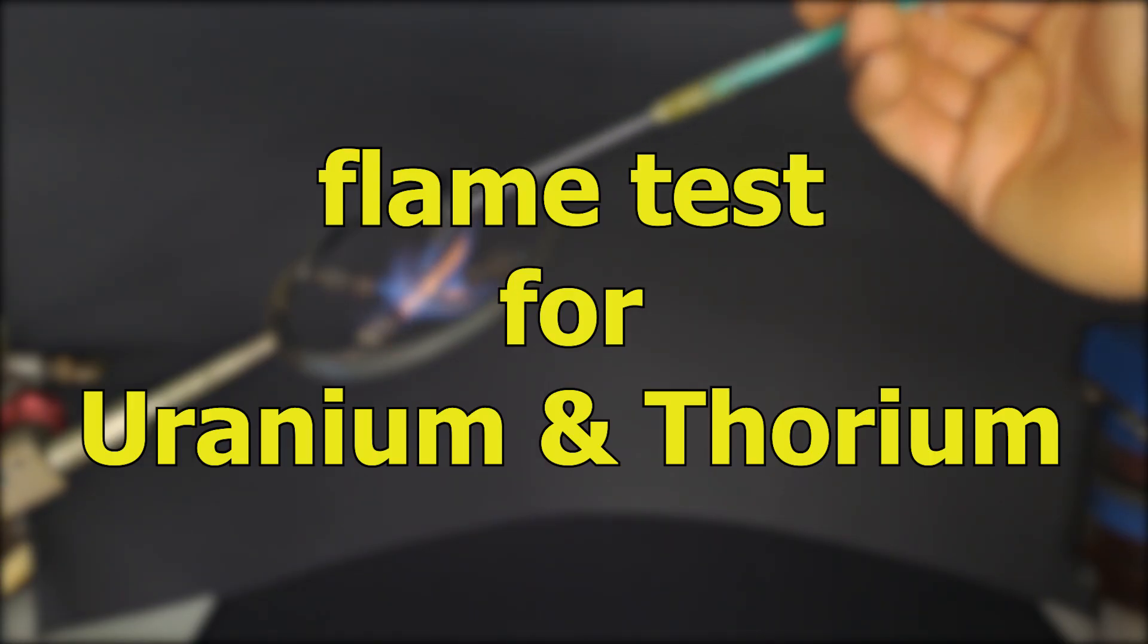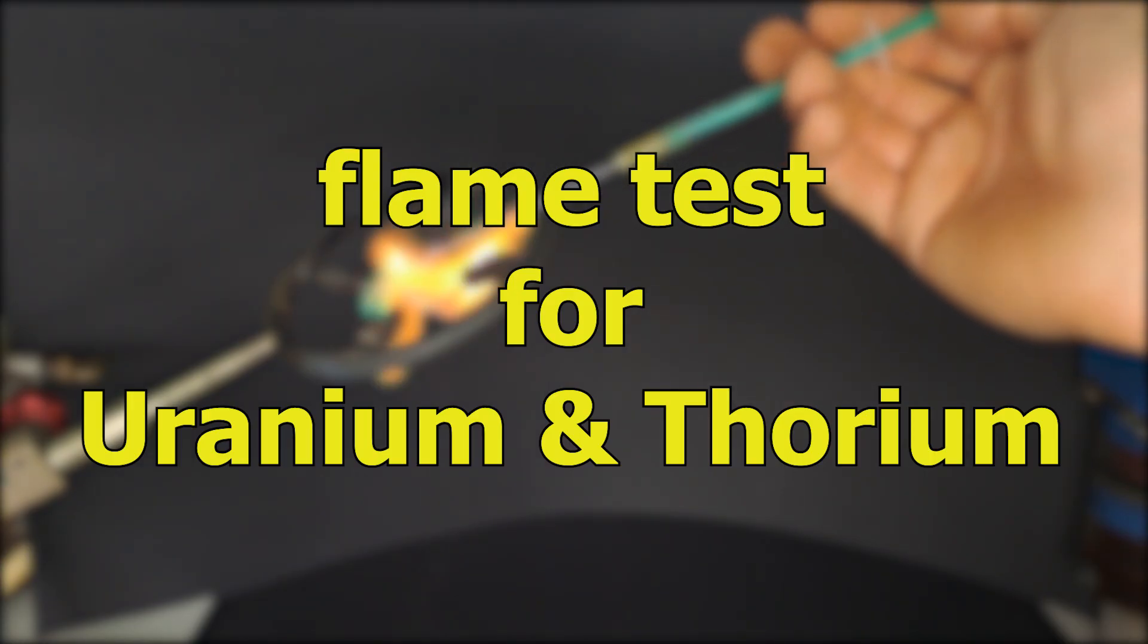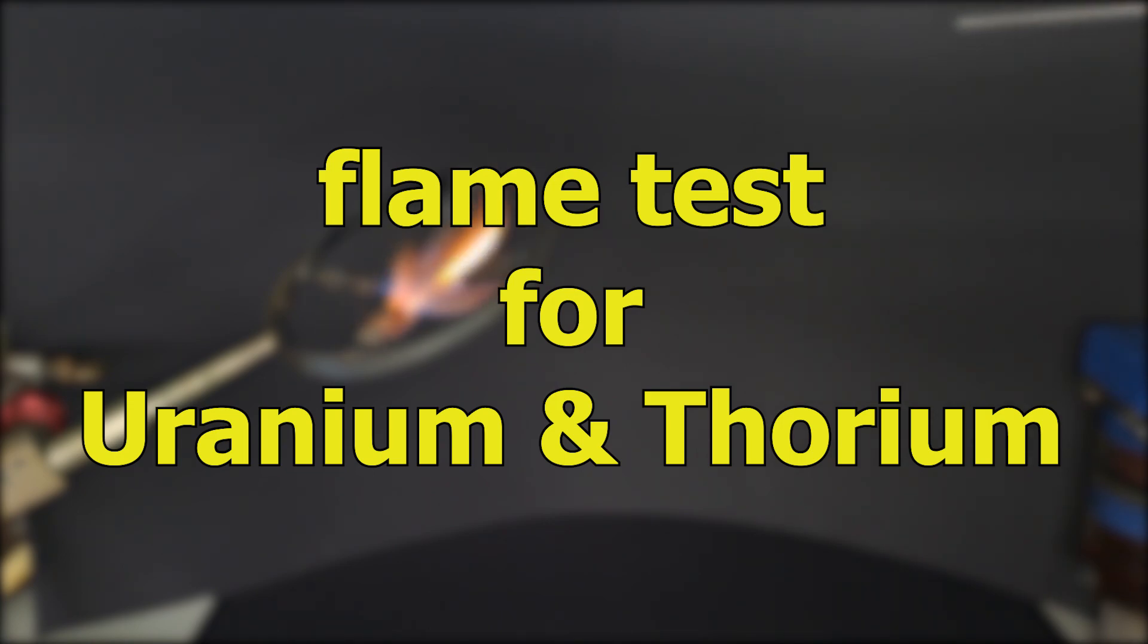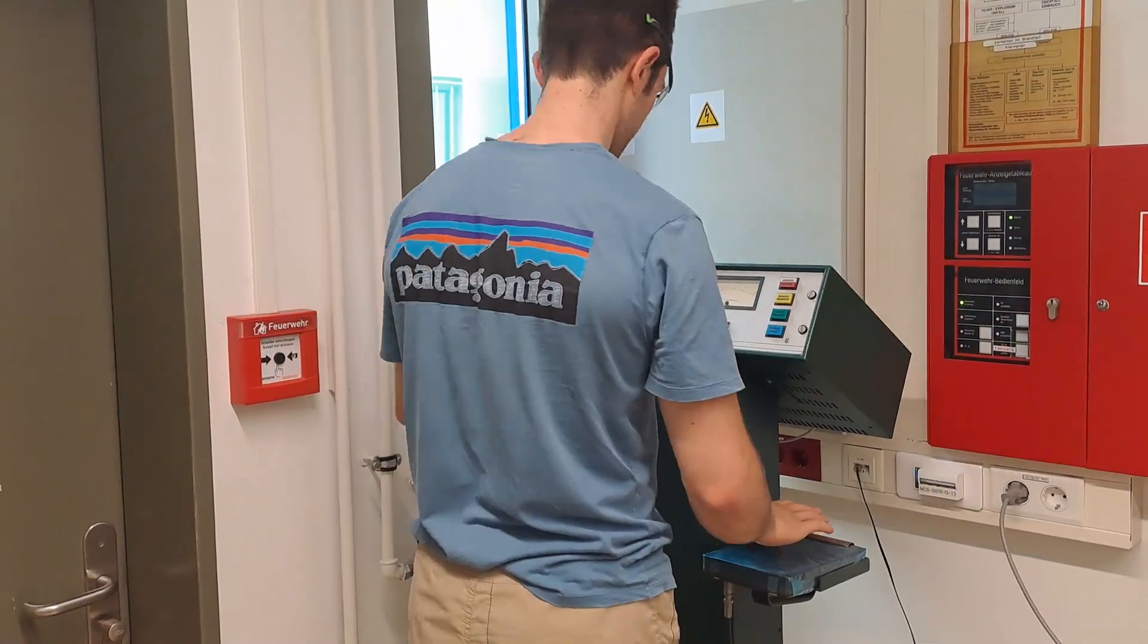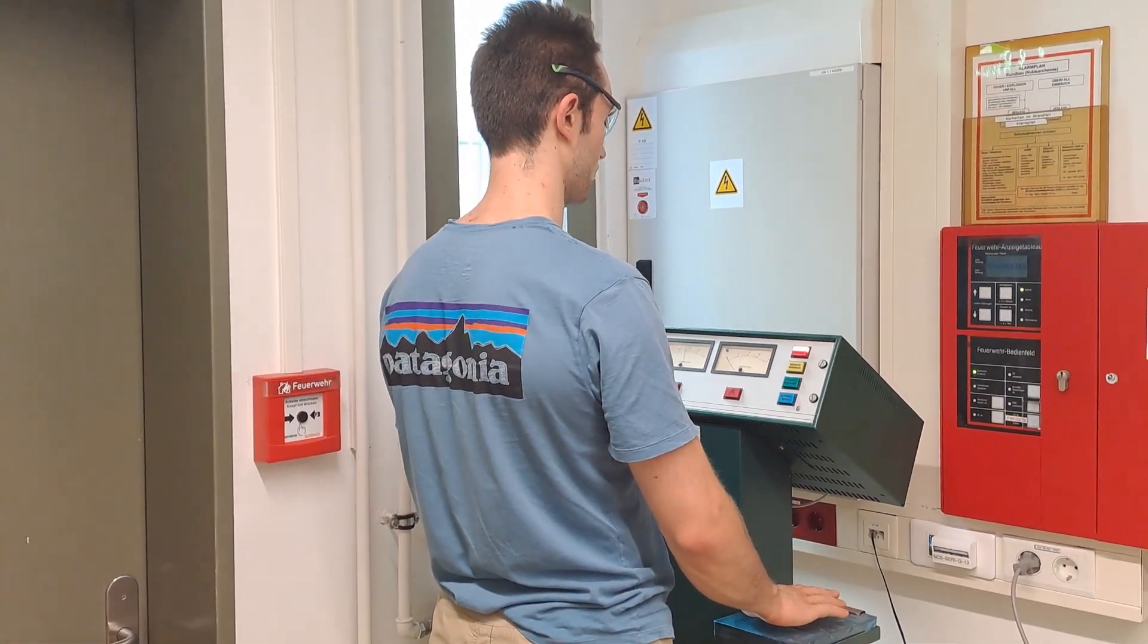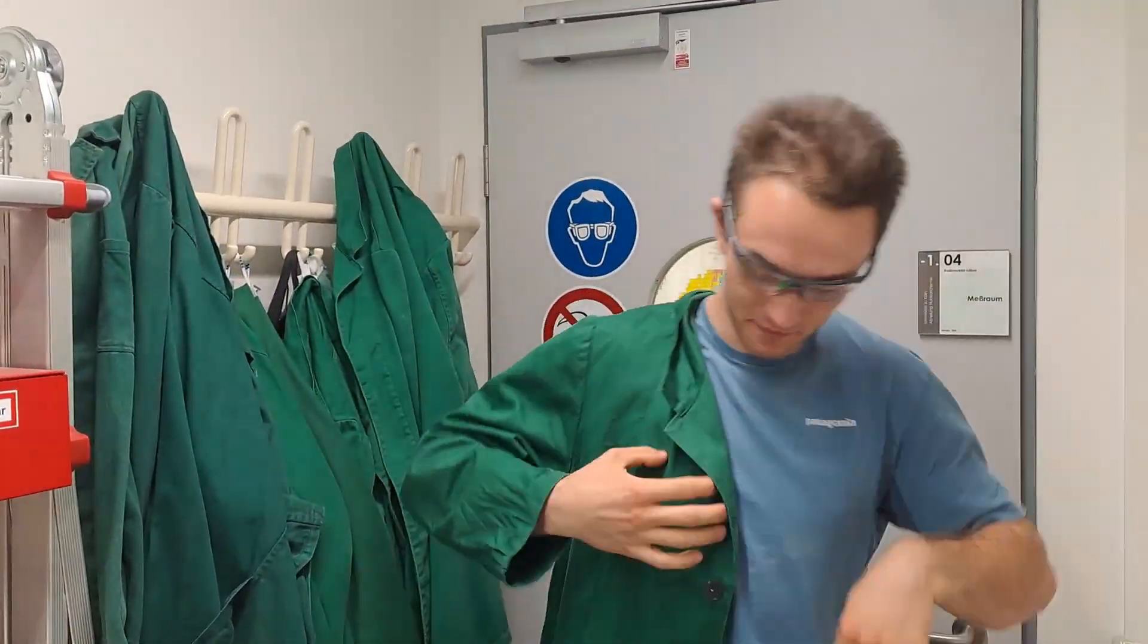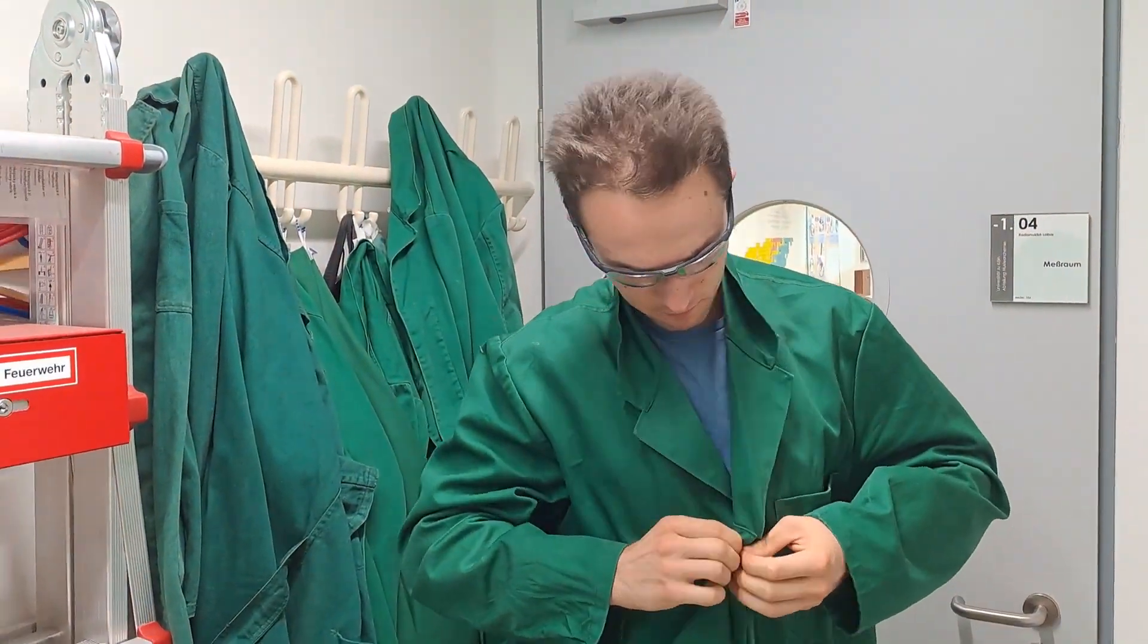I wanted to find out what is the flame color of uranium and thorium. Radium supposedly has a red flame color, but as with much of the basic research on radioactive elements, it's decades old and the quantities they used back then are simply unimaginable.